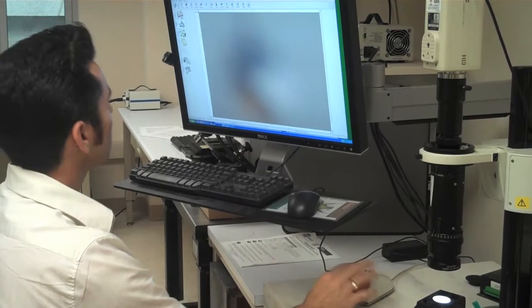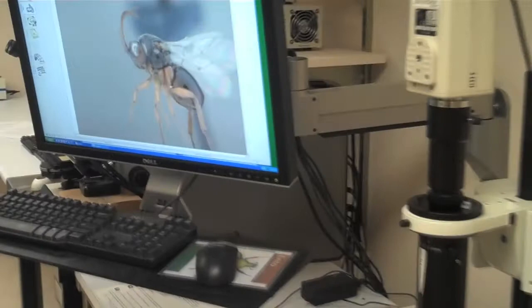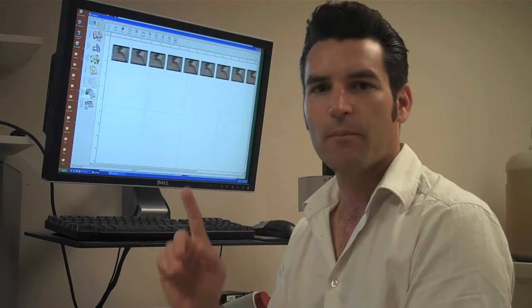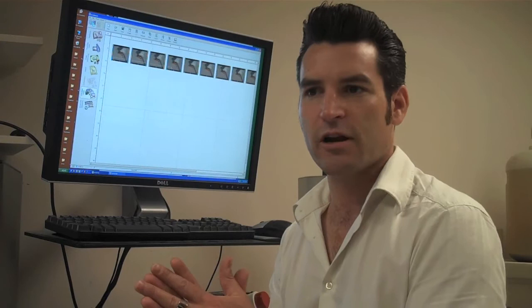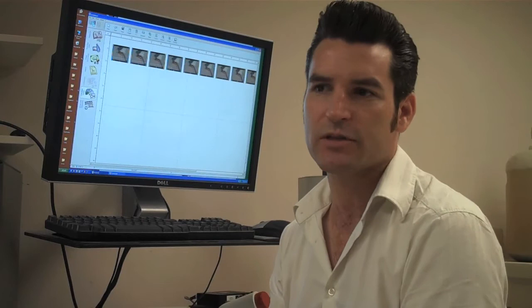One of the ways we've combated this and kind of created a very cool solution to this is to actually take a series of focal planes through the subject and using a computer algorithm collapse all of the in-focus pieces of each of those focal planes into one composite image. It's not technically a real image because it's physically impossible to obtain such a thing. So it's more or less a virtual image. But for the purposes of illustrating what an insect looks like, what its color is, how the wings are relative to the length of the legs, those sorts of things, what we call a habitus image, the technology is superbly suited for that task.